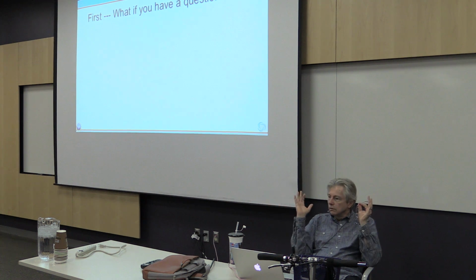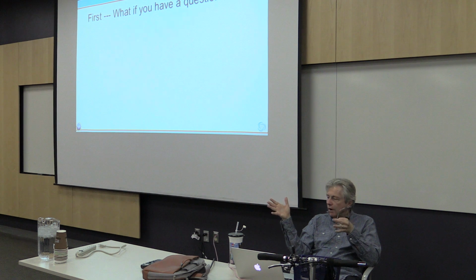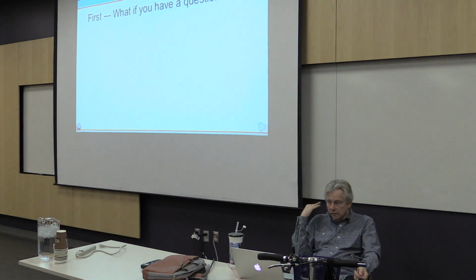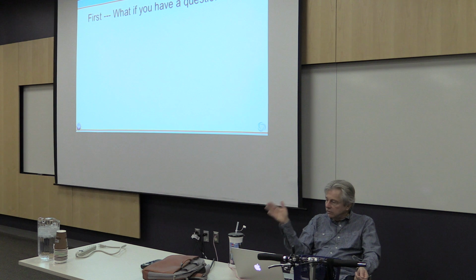We have to have a strong idea to begin with, where we start and where that leads to, in order to get whatever answer we want out of the data. We have to keep in mind, at least in the back of our minds, how each step is affecting what we actually see in the end.